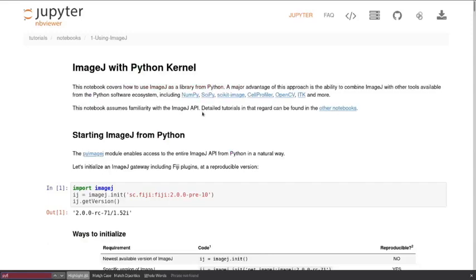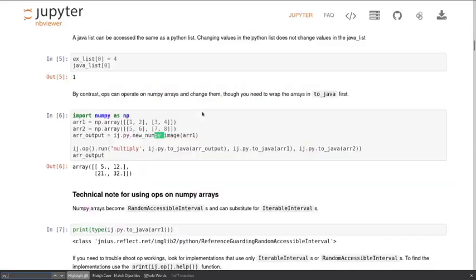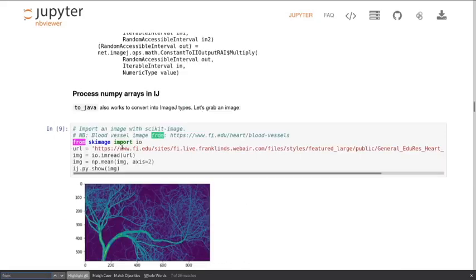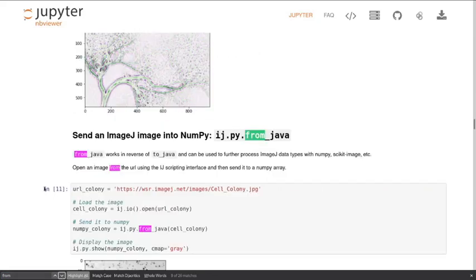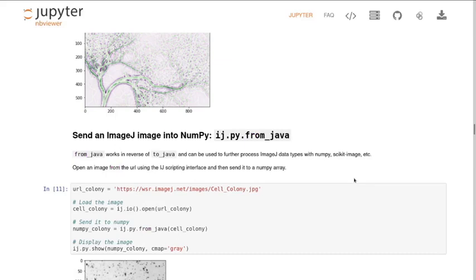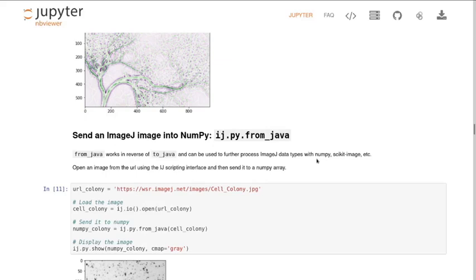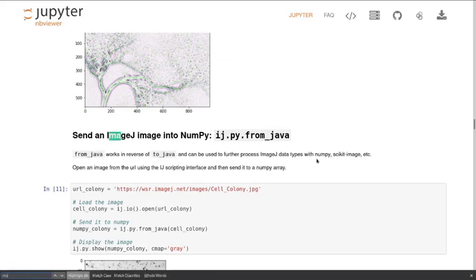Then you want to pass it to an ImageJ plugin that you've been using for years and you don't want to change from because you know it works and you know what parameters to use, so on and so forth. Then you want to take those results and play with them in pandas to do some statistics.